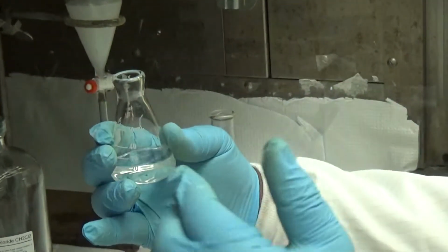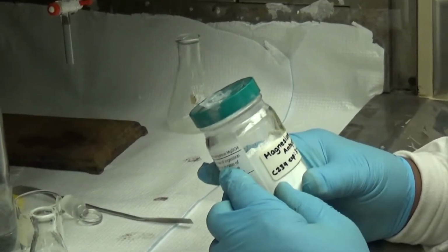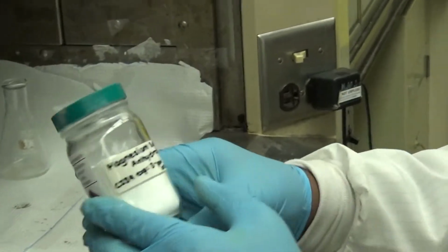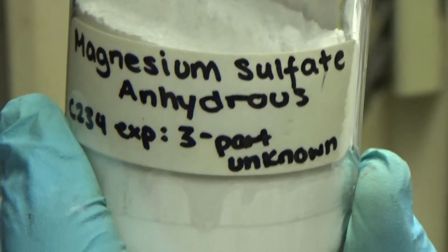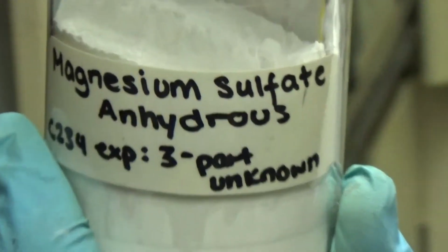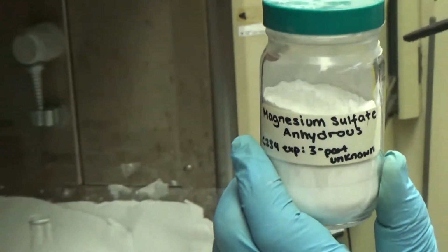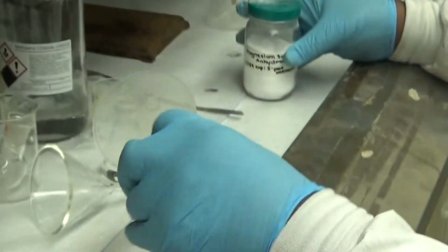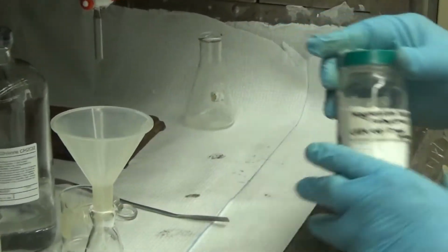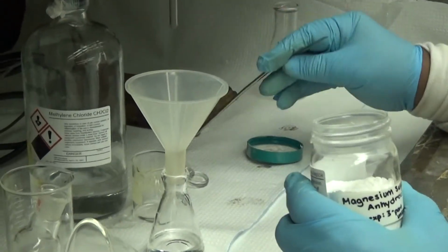In order to remove this leftover water, I'm going to use a drying agent. The drying agent which was made available to me was magnesium sulfate anhydrous, MgSO4. Anhydrous means it's a special crystalline version that does not have water. They also have magnesium sulfate that has water, and that would be bad. They call that the hydrate. We use that for some experiments.